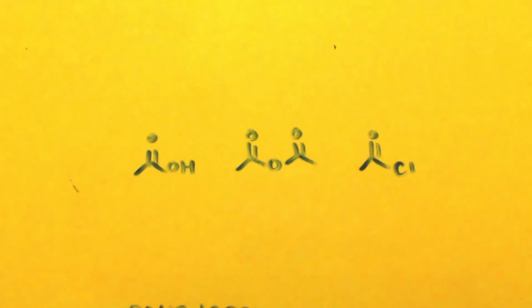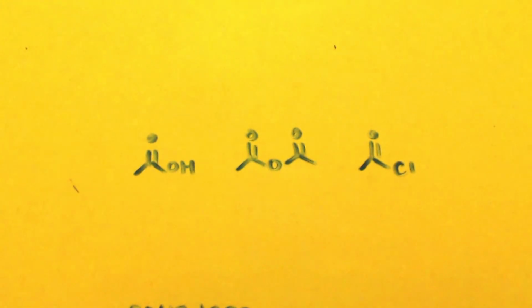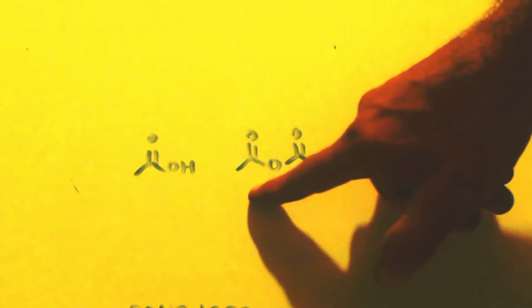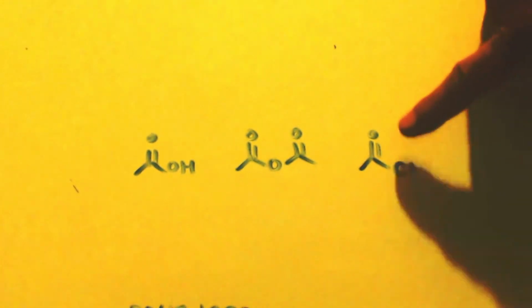Now I keep saying anhydrous acetic acid. And what I mean by that, I don't mean glacial acetic acid where you took all the water out. I'm talking about acetic anhydride. Okay, that's when you link up two acetic acids together. That's the anhydride. That's what I mean when I say dry or anhydrous. I really misspoke there. This would be the best stuff to have, because from this you can make anything. You can make anything below it, which would be this or whatever. Or any kind of acyl transfer, this is the best thing to have.